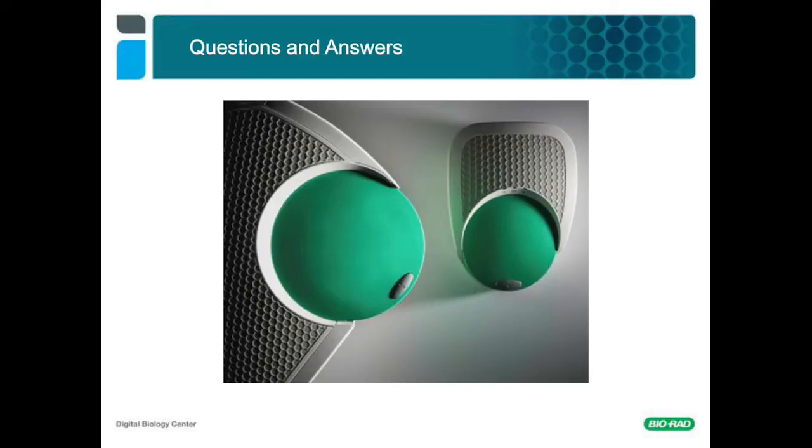Jack, our first question is regarding sample prep. What protocol do you use to isolate the genomic DNA for these long-range phasing assays?